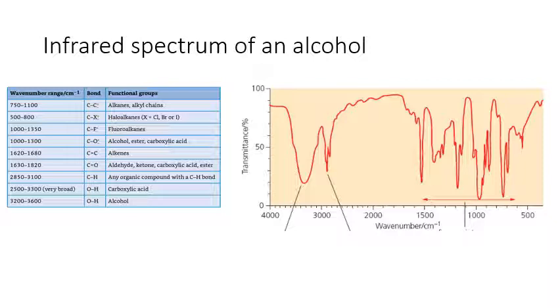First of all, we've got this whole peak here, which occurs about 3,300 or 400, and it's quite broad. It's got a characteristic broadness about it compared to some of the other spiky ones.